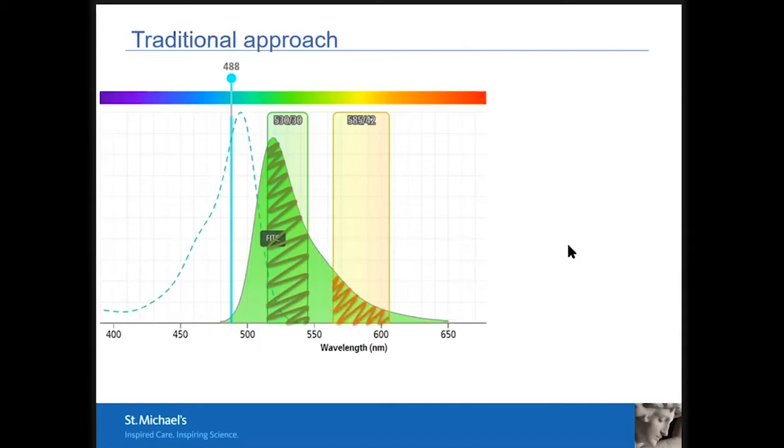And then quantitate the amount of inappropriate spillover signal in neighboring detectors, and here we're only showing one of them. Then we're going to say this fake full signal that we have here, which is only a part signal, is X amount. This little orange piece of the pie is how much of the green piece of the pie proportionately. Okay, it's 13%. So now I'm going to take this fake full signal, take 13% of it and subtract it from that neighbor channel, and we go back down to a baseline of 0.